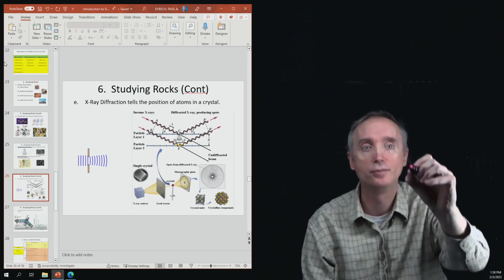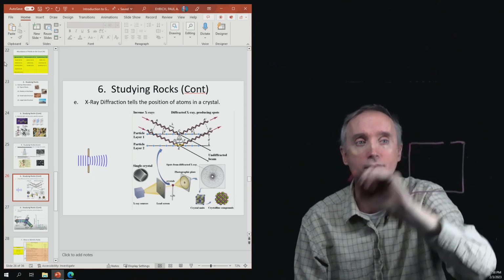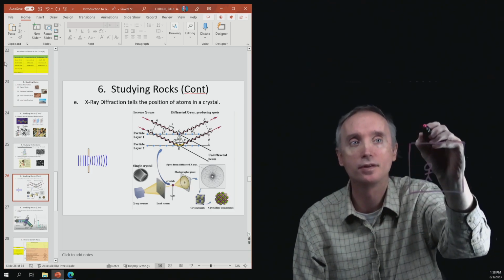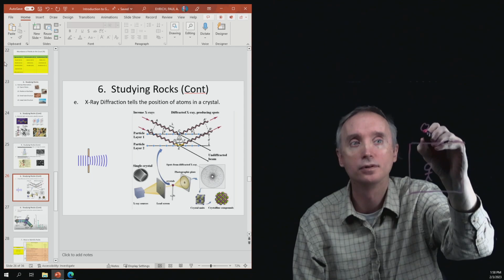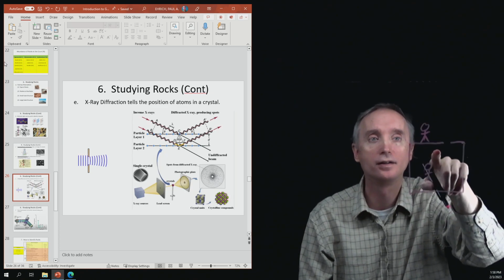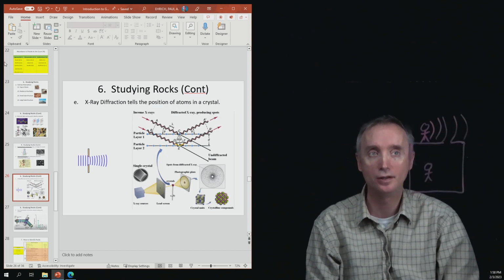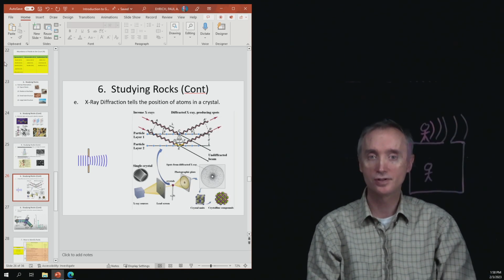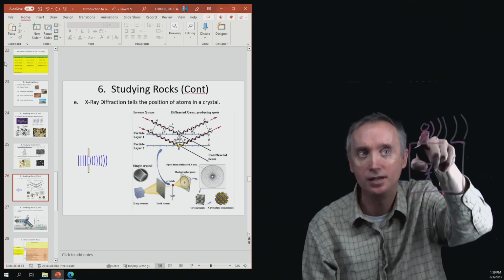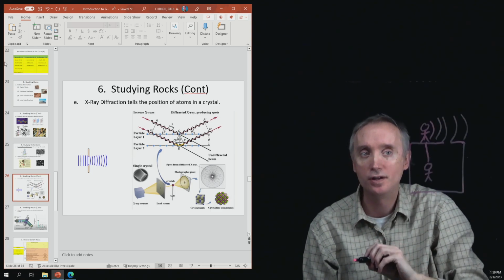So if you could imagine a room like this, and then there's a door like that, and let's pretend that you're inside the room, and then let's also pretend that there's somebody outside the room. And then let's say that they are speaking. So those are the sound waves being emitted by them. You can still hear him or her if you're inside the room. Now you can't see this person because of the wall. So that wall gets in the way, so you can't see them.